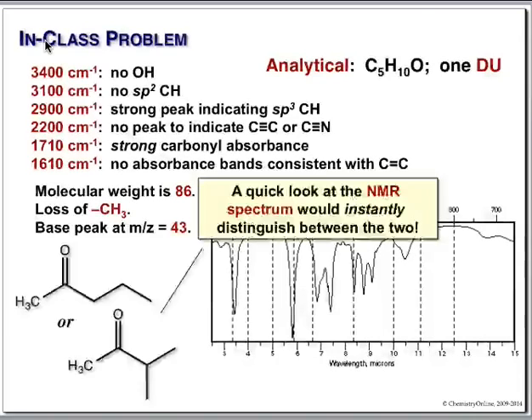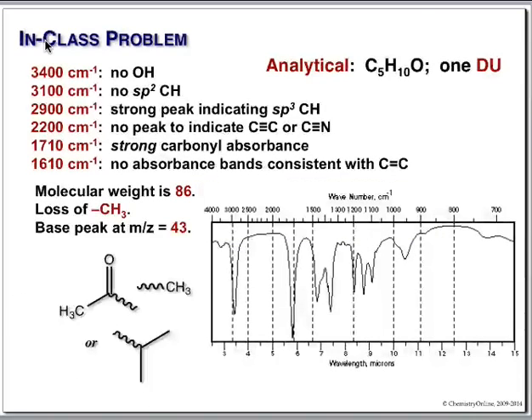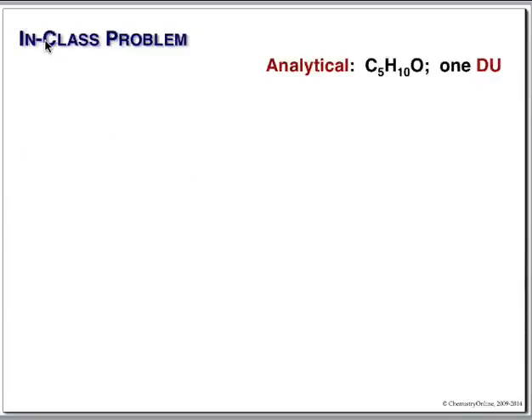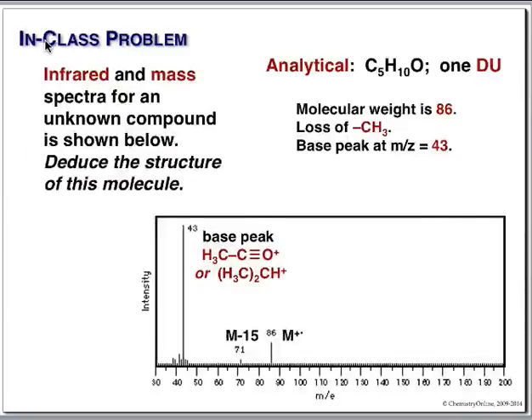And that will be actually in a long time, won't it? I have a question. Yeah. Going back to the mass spec, after we went from 86 to 71, we determined we lost the methyl, and then our base peak was at 43. Right. So did that tell us? Let's see if we can go back to the mass spec. This one, you mean?